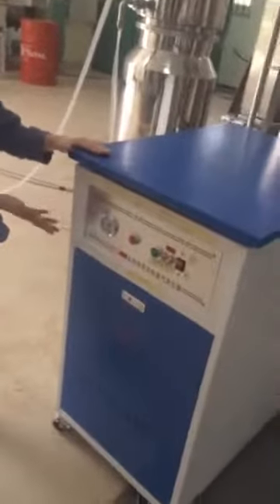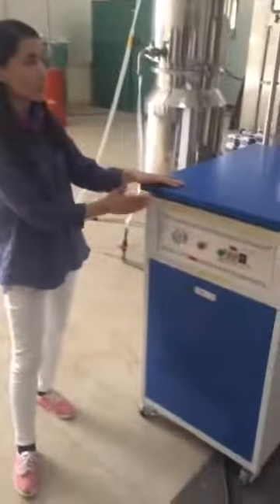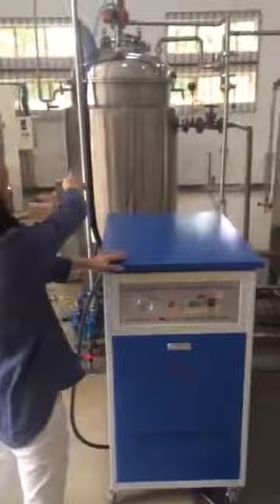Here, this is a steam generator. This steam generator will generate steam to supply this distillation line and contracting line.